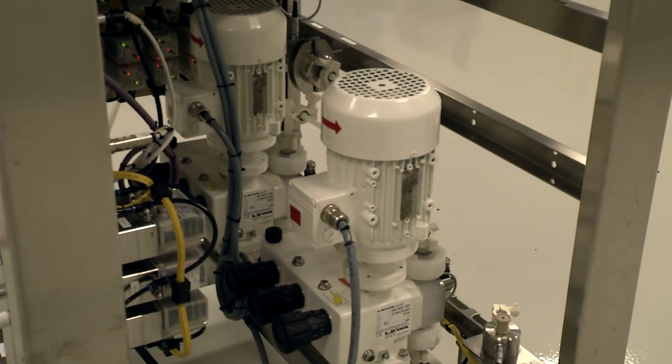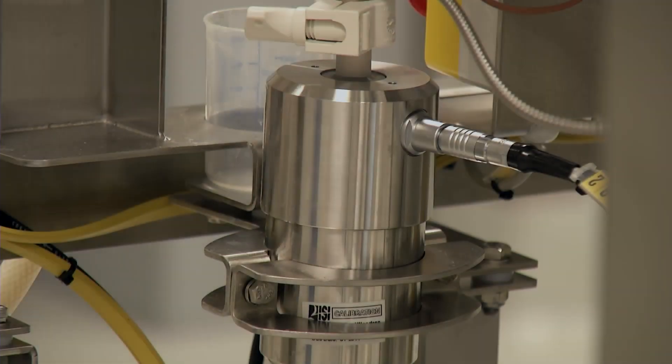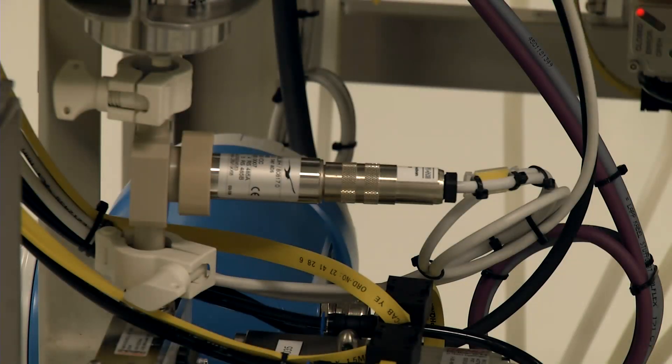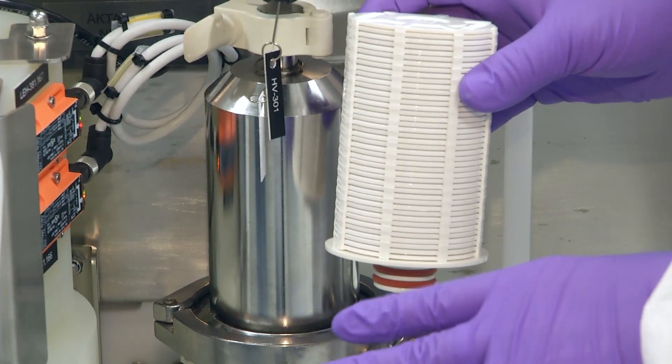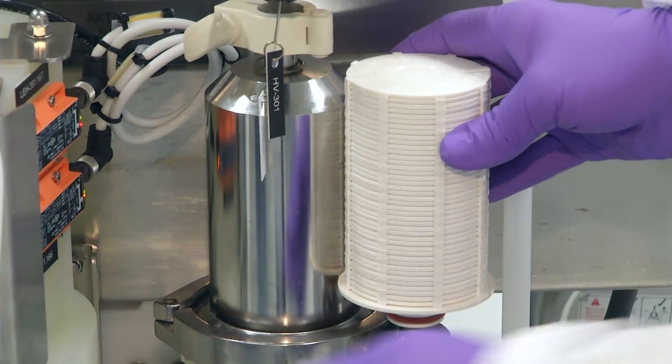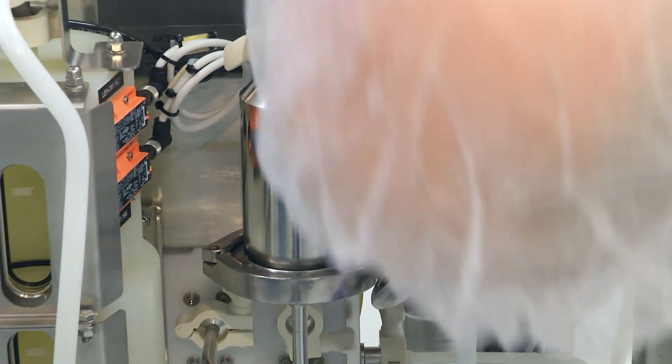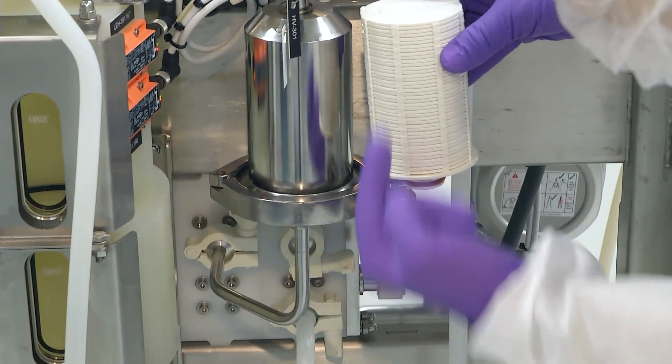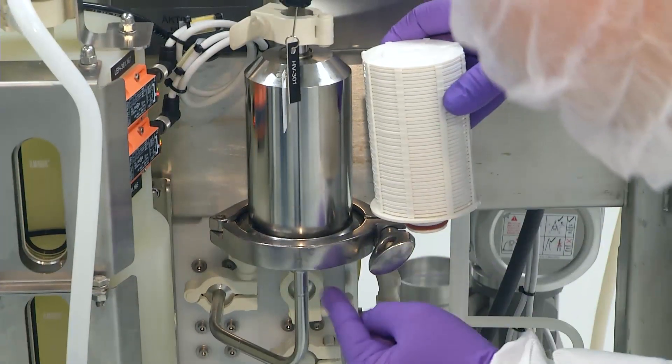The pump draws the lysate from the vessel, past the first conductivity sensor and pressure sensor, and through the 0.45 micron pre-filter. The pre-filter removes any residual cell debris or other particulates that may have contaminated the solution.